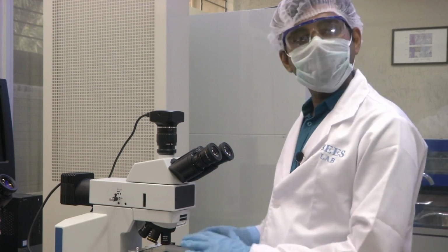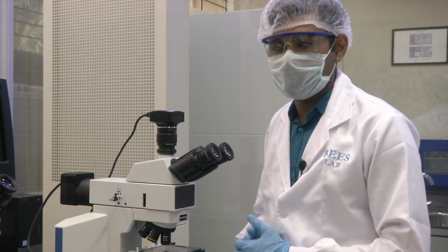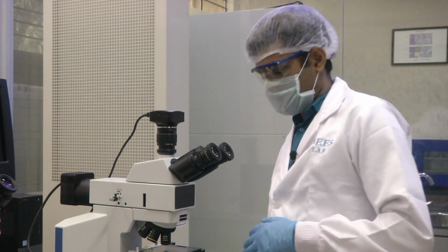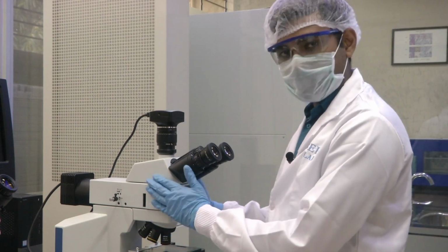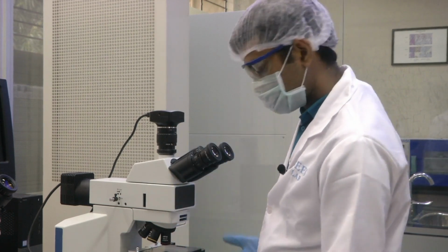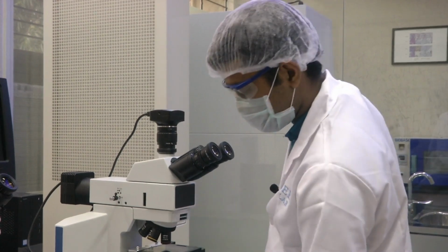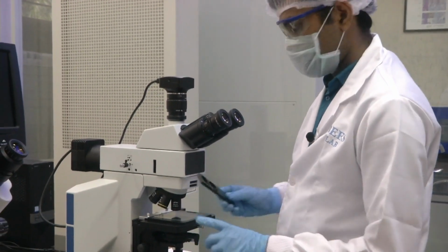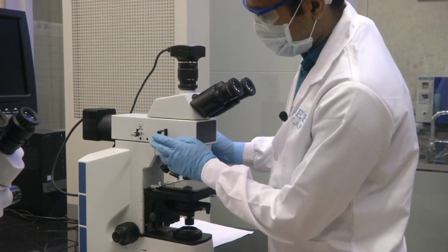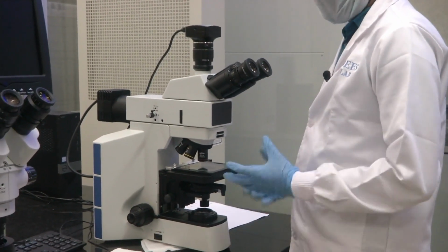Fluorescence microscopy can also be done with this microscope. We will not get into that much detail because that is more biology oriented, and this is a microfabrication course, but we thought that you should know about it. So, this microscope is also capable of carrying out fluorescence microscopy. As I told, there are filters and aperture adjustment equipment like this. We can adjust the aperture like this and then conduct the microscopy.